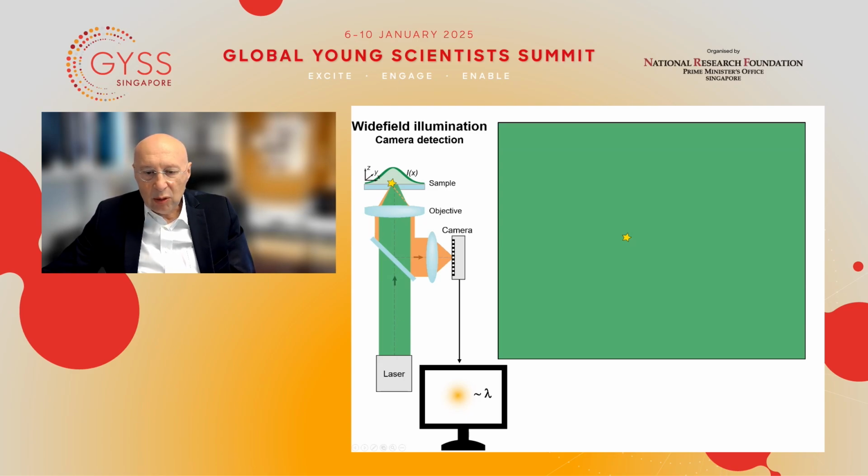So in other words, once we have identified the maximum of this diffraction blob, then we know where the molecule is because that must correlate in space with the actual position of a molecule in the sample. So the whole point of localizing a molecule is then to find out the position of the diffraction maximum with maximum precision, because we want to know with very, very high precision, and accuracy, where the molecule is.